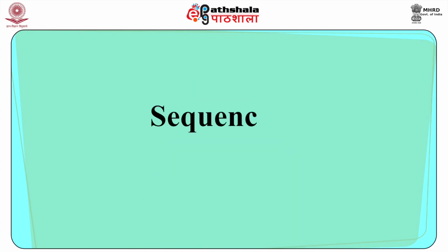Now, as regards sequencing, single stranded template DNA library beads are added to the DNA polymerase and are layered with enzyme beads containing sulfurylase and luciferase onto a picotiter plate device. The device is centrifuged to deposit the beads into the wells.